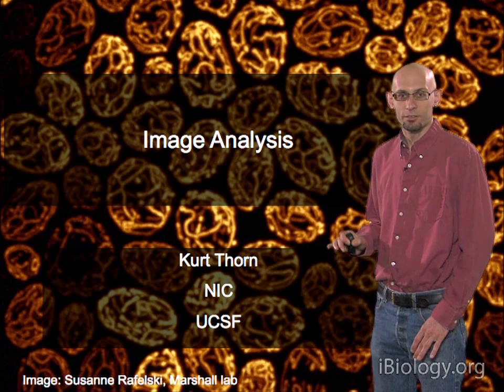One way to do this is taking a camera dark image: take an image where no light is coming to your camera, and then subtract that off. Or you could take an image of, say, an unstained sample or a mock stained sample that doesn't have any dye in it, estimate what the background intensity is there, and subtract that off. Then there are also approaches where you can estimate the background from the image, and that's what I'll mention first.